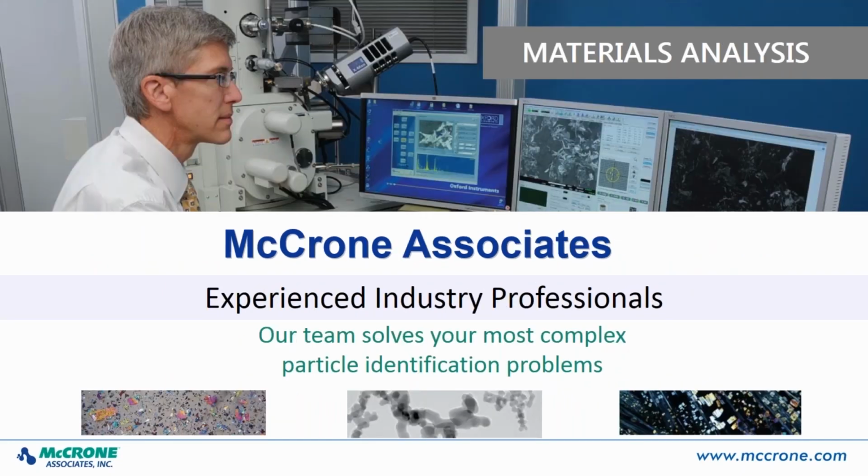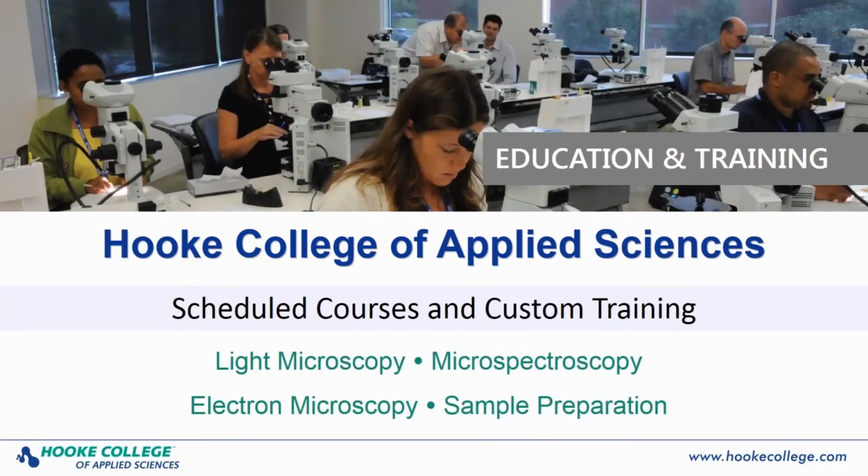Okay, here's a question from Christine. She wants to know, for the nylon fiber that was shown, exactly what optical properties would you have to measure to determine that it's nylon? To identify most synthetic fibers, really all you need are 3 or 4 optical properties. If you know the retardation color precisely, and you measure the thickness or the diameter of the fiber, you can use those 2 bits of information to calculate the birefringence, the difference in the 2 indices, and that'll tell you that it's nylon.